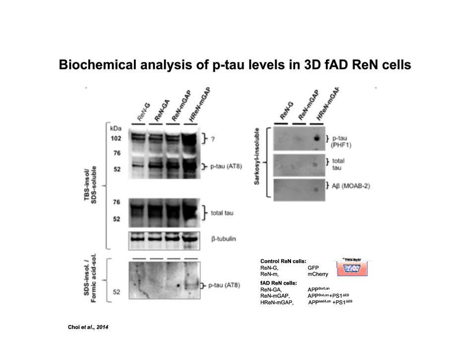Okay, this is actually the first data we found about the biochemistry. You can see the hyperphosphorylated tau we can find in the insoluble fractions. The antibody against phospho-tau shows a nice increase of these species in AD cells as compared to the control NG cells. And you can see it even in the SDS-insoluble, formic acid soluble fractions, which are highly, tightly aggregated fractions. You can see there is phospho-tau. And we have another assay with the detergent sarkosyl, which also shows the robust aggregation of tau species in these cells.